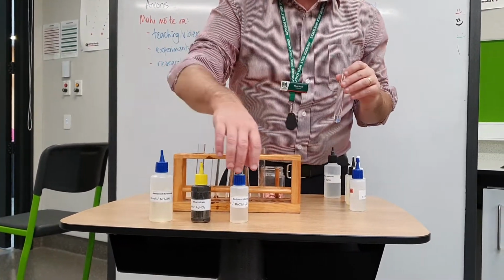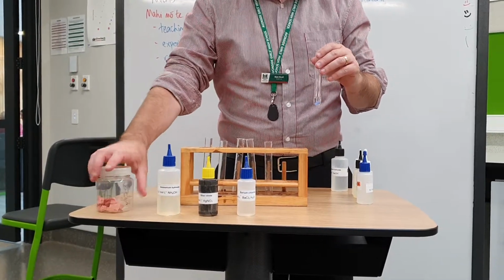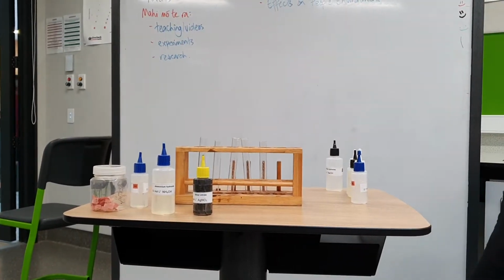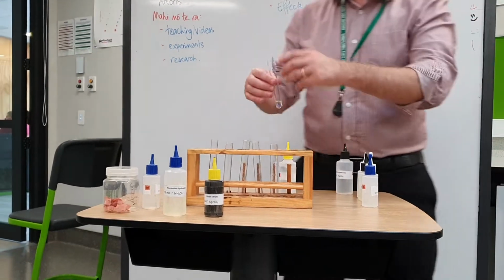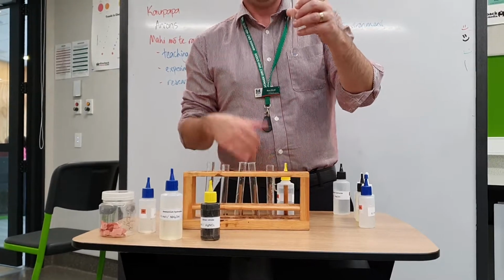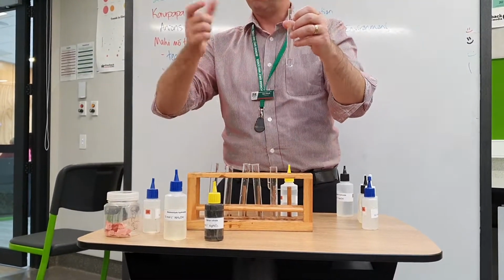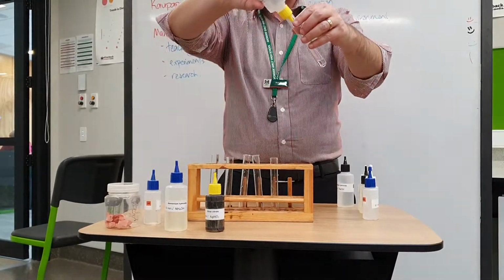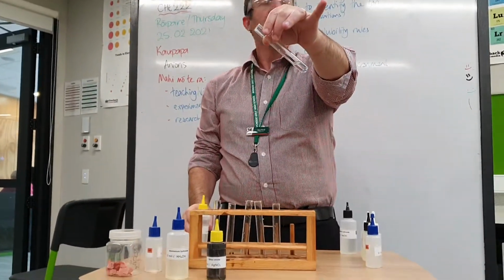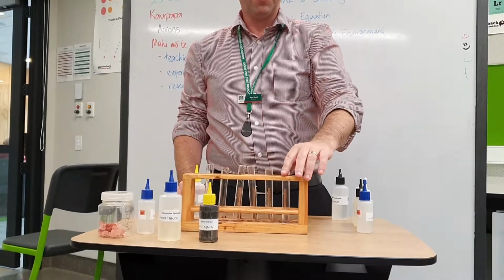I've used my litmus paper, and my next chemical on my flow chart is to add some hydrochloric acid, or actually any acid. It can be sulfuric as well. And if it does nothing that we see, then it is hydroxide. It might turn my litmus back red if it goes beyond the neutralization point, but basically if I don't see any bubbles, and I don't see any bubbles in there, then I know that it's hydroxide. And I've identified that ion and I'm ready to move on to the next one.